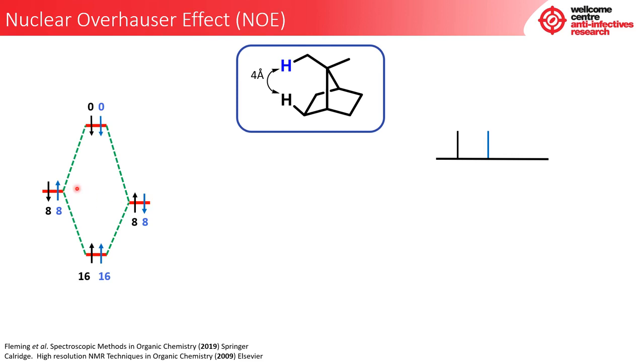What do we mean by this? Well, there are numbers located at the bottom, which relate to what we learned before about the populations of each energy system. But when we talk about a high energy state, we mean with field or against field. With field typically refers to an arrow pointing up, and against field refers to it pointing down. The down means that there's a higher energy associated with it, hence why it's found in a higher energy system.